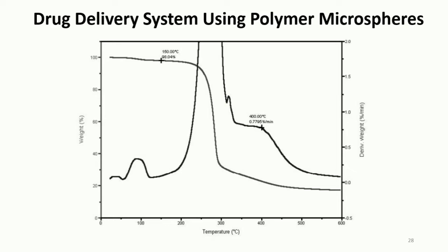Until now, we have focused on differential scanning calorimetric analysis of individual amorphous or sometimes crystalline drugs in pharmaceutical analysis by using thermal analysis.